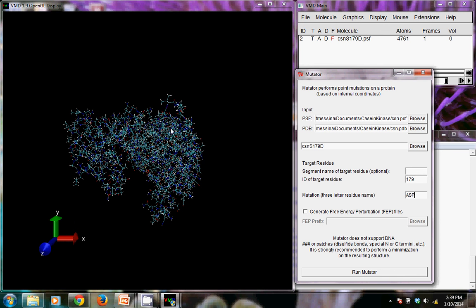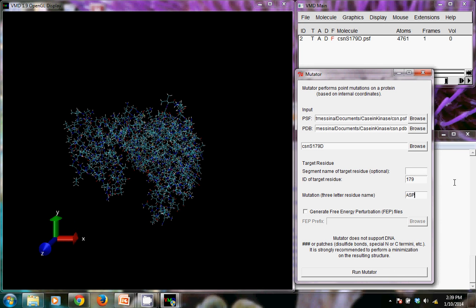And you see things happen here. If you go to the console window, you can open that through the extensions menu. It'll tell you that it completed successfully.